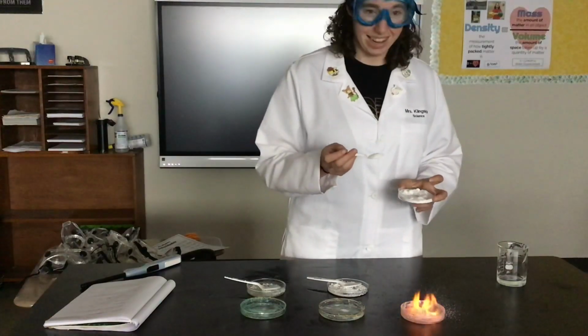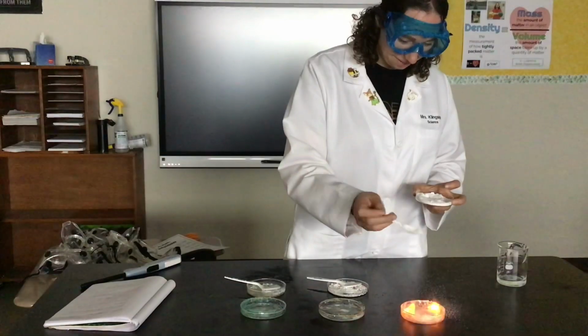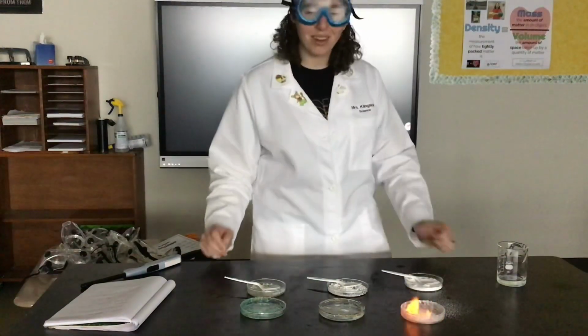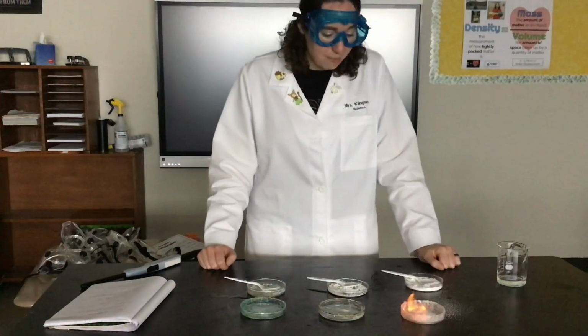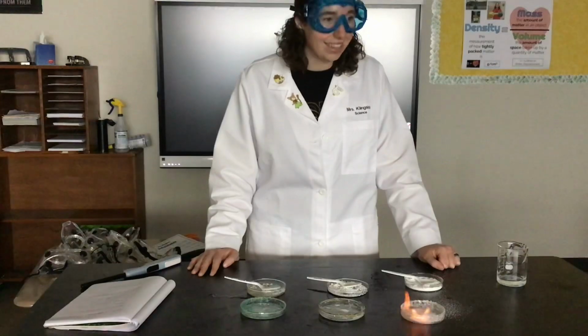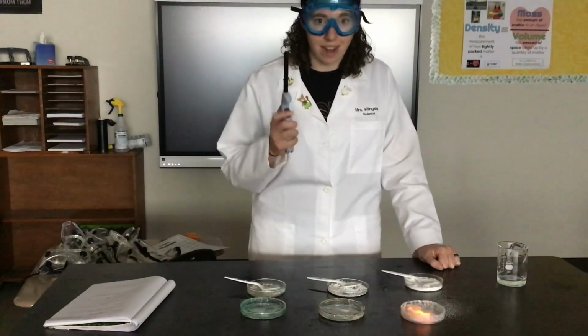You see it? Turns orange, isn't that cool? So when it mixes with the borax, it has the chemical reaction, the chemical change that makes it orange. When that color changes, it lets us know a chemical change has happened. Okay. All right, we're going to move on to the calcium chloride.